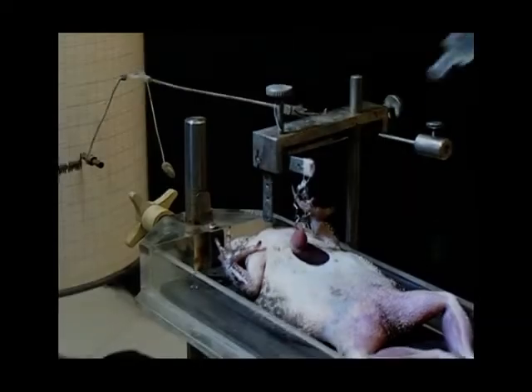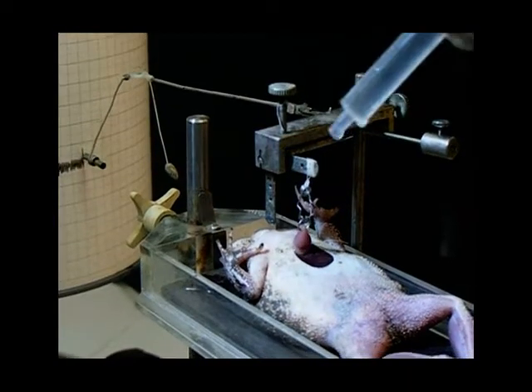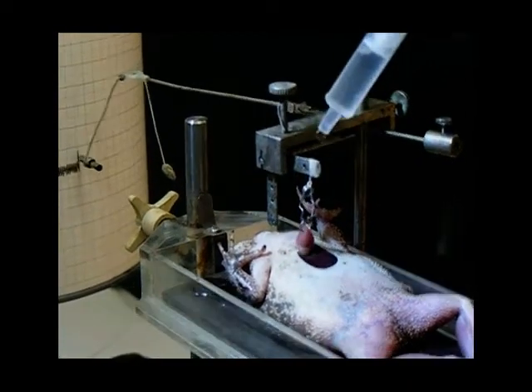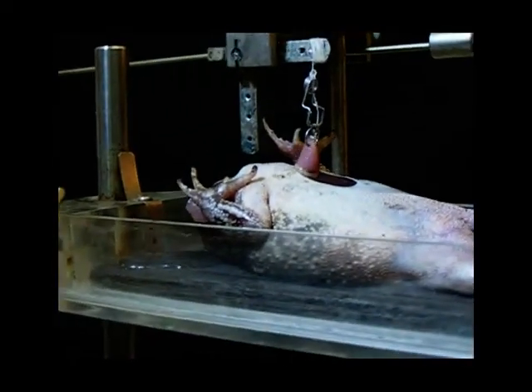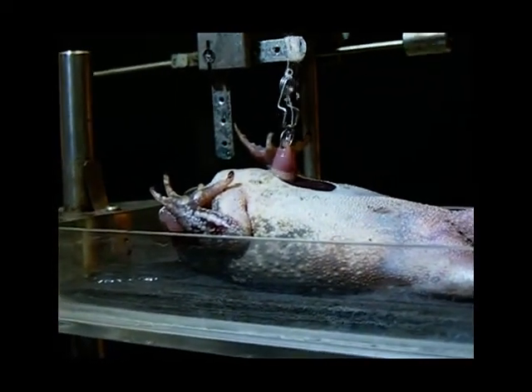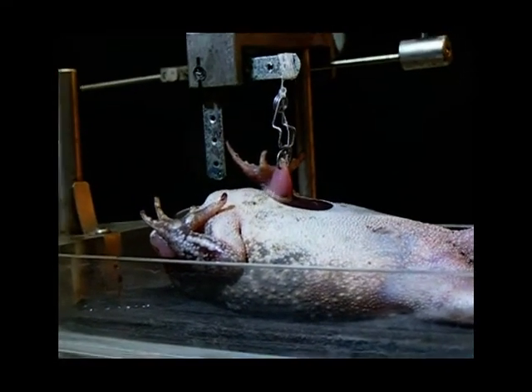It is essential to keep the preparation moist at all times during the experiment by dripping physiological salt solution onto the surface of the heart. Drugs can be applied in a similar fashion by dripping solutions directly onto the heart using a pasteur pipette.